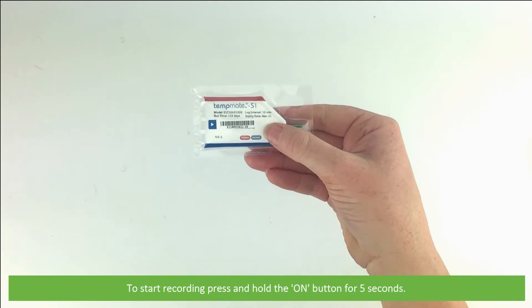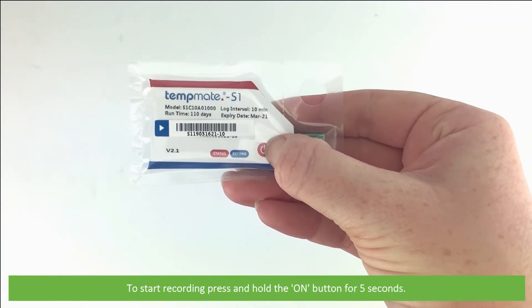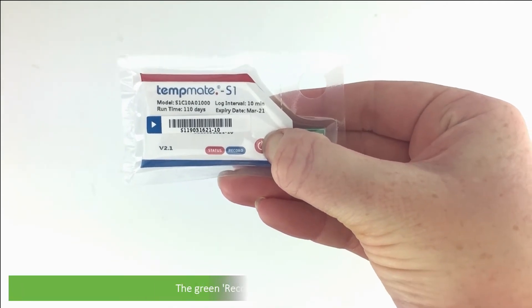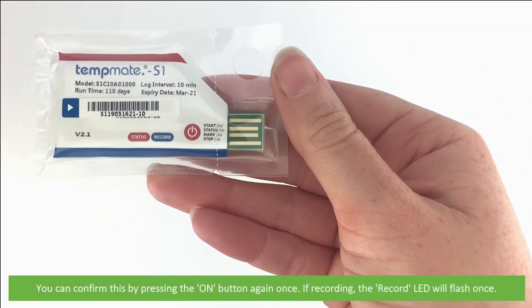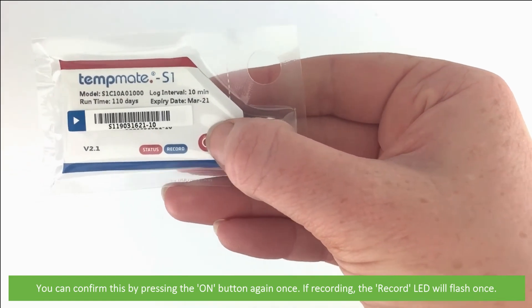To start recording, press and hold the on button for five seconds. The green record LED will then flash ten times. You can confirm that recording has started by pressing the on button again once - if recording, the record LED will flash once.